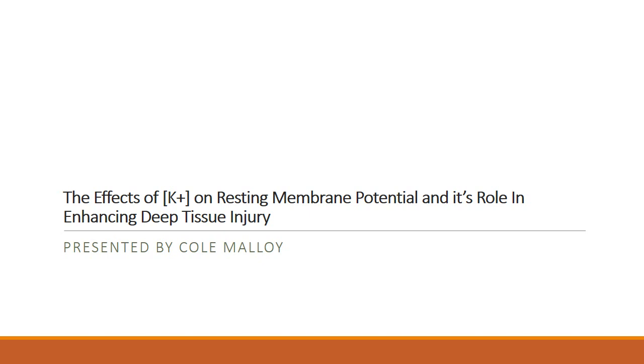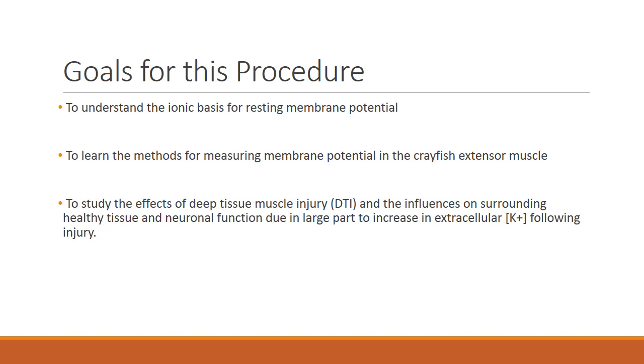Hi, my name is Cole Malloy, and I'm presenting the effects of potassium concentration on resting membrane potential and its role in enhancing deep tissue injury. The goals for this procedure are to understand the ionic basis for resting membrane potential, to learn the methods for measuring membrane potential in the crayfish extensor muscle, and most importantly, to study the effects of deep tissue muscle injury, or DTI, and the influences on surrounding healthy tissue and neuronal function due in large part to increase in extracellular potassium following injury.